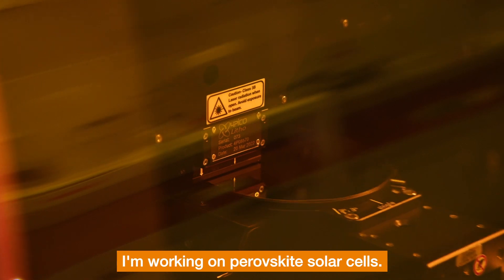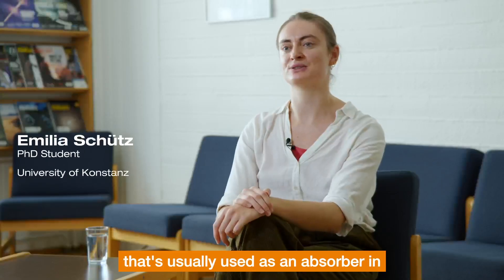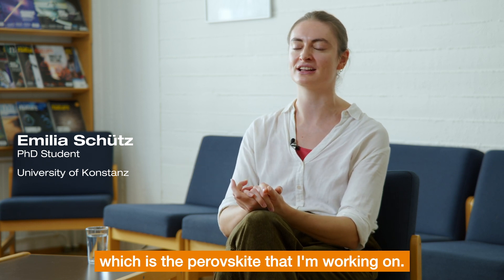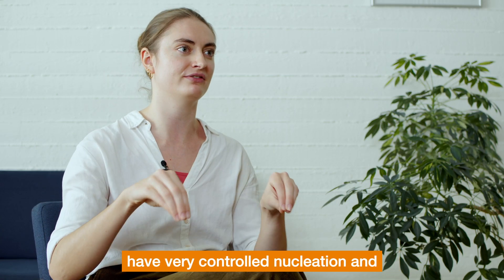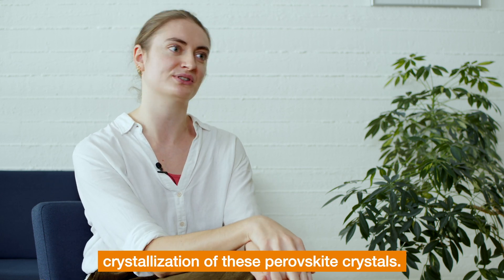I'm working on perovskite solar cells — substituting the silicon usually used as an absorber in common solar cell technologies with perovskite, a new and hopefully better material. I'm using the PicoMaster to pre-pattern my substrates in order to achieve very controlled nucleation and crystallization of these perovskite crystals.